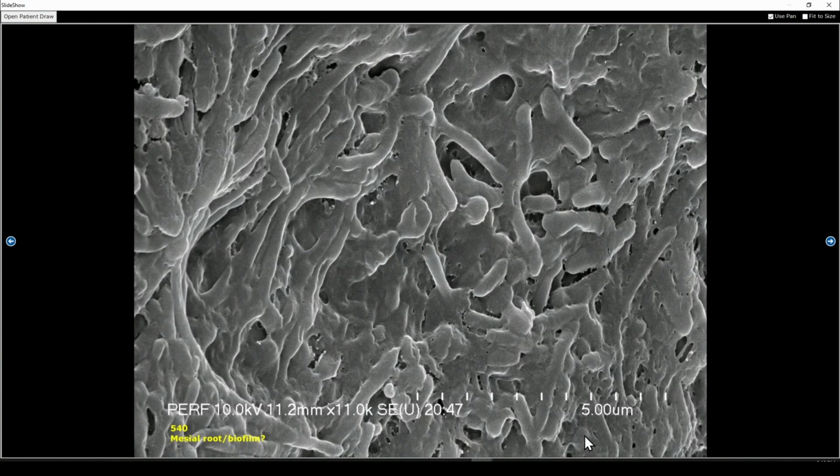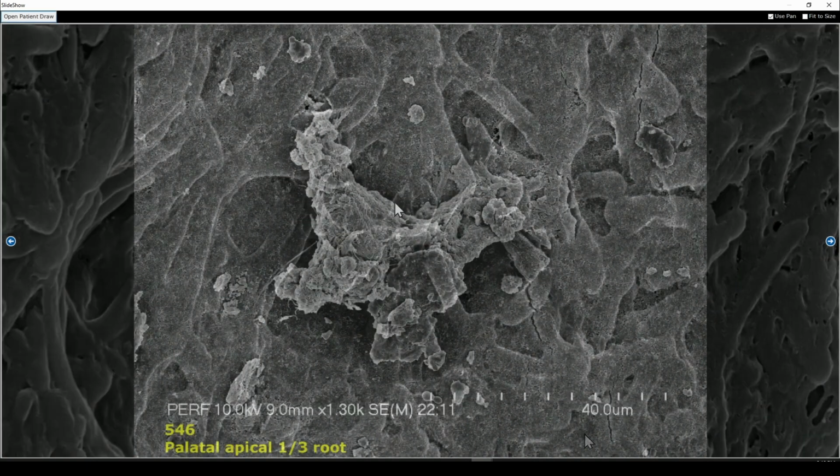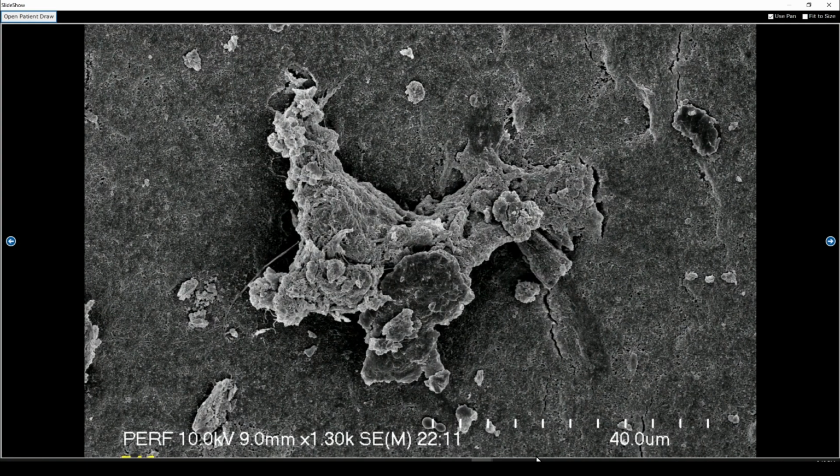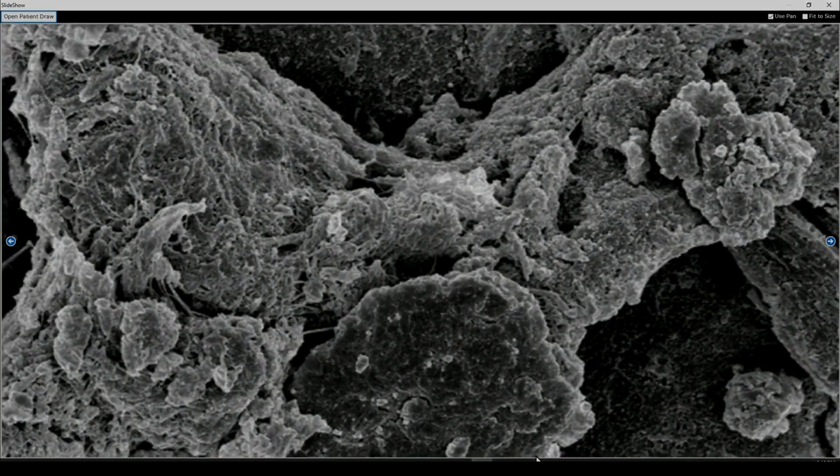So as an example, this is a case of Rick's. Now I hope you can kind of see what we're talking about here and maybe identify it using your pattern recognition of how this actually appears.